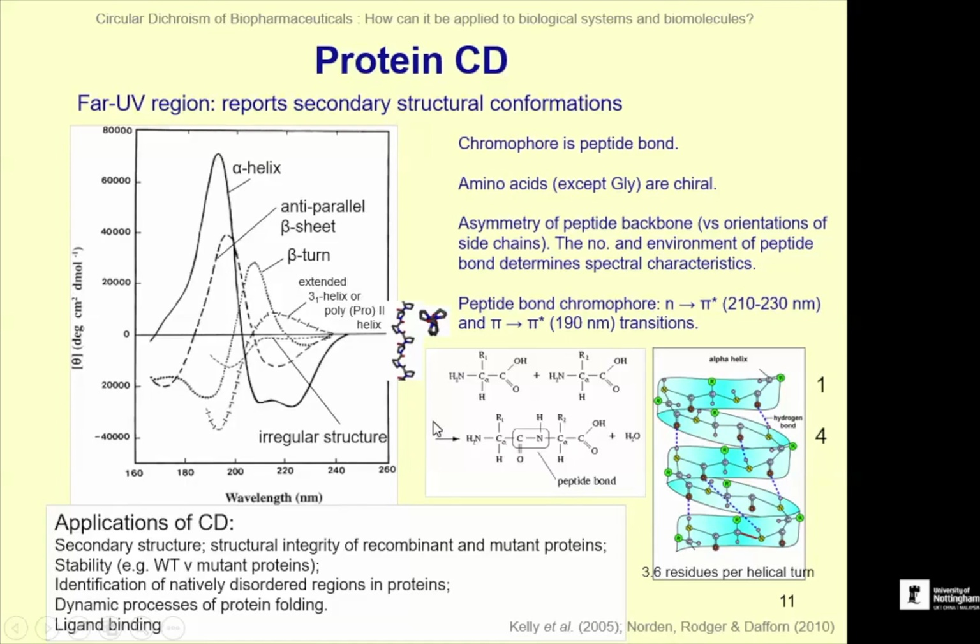You may have put your protein through all sorts of harsh biochemical, chromatography-based purifications. Myself, I work with membrane proteins, so I have to shove loads of detergent in there to solubilize them. These are damaging chemicals. At the end of the purification process, I want to know that my membrane proteins are still intact, that they still have secondary structure to do something meaningful with them.